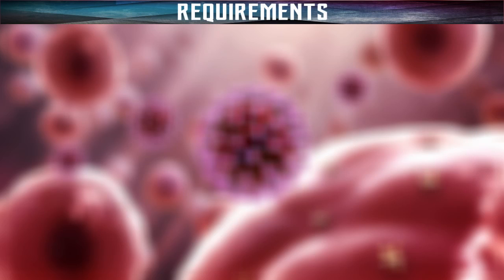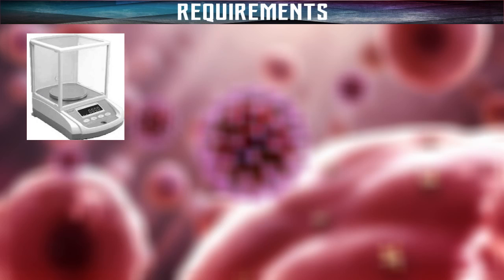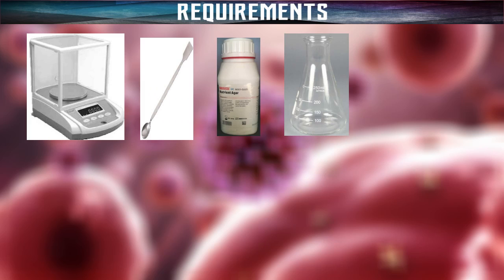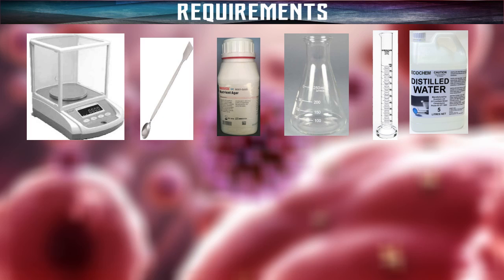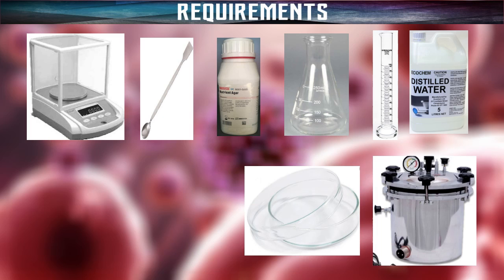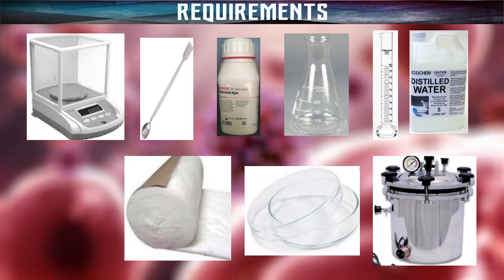The requirements for these preparations are electric balance, spatula, culture media powder which is commercially available, conical flask, measuring cylinder, distilled water, autoclave, petri dish or petri plates, cotton and incubator.